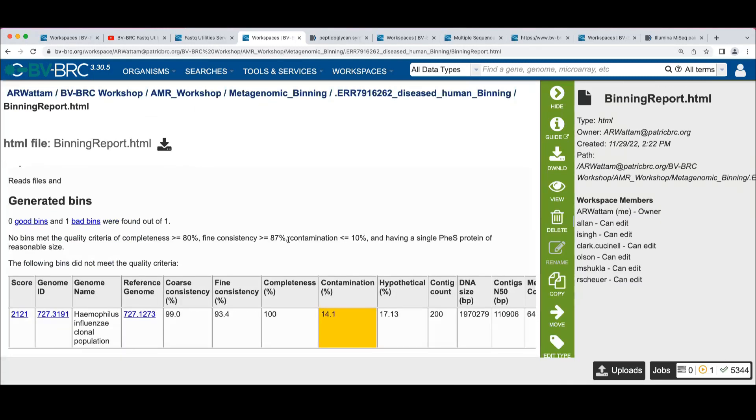What this is going to tell us is a summary of what it found in the binning run. So here we say we have zero good bins and one bad bin. So what's good and bad here?